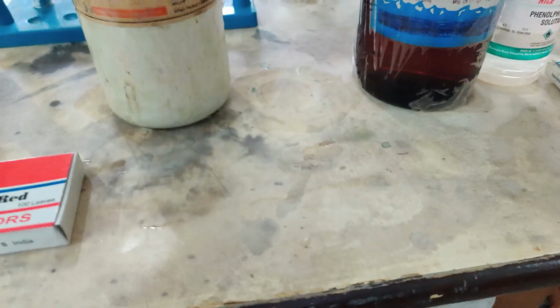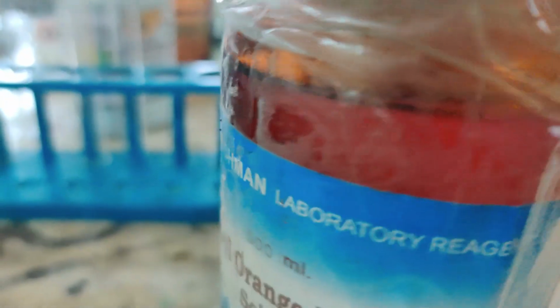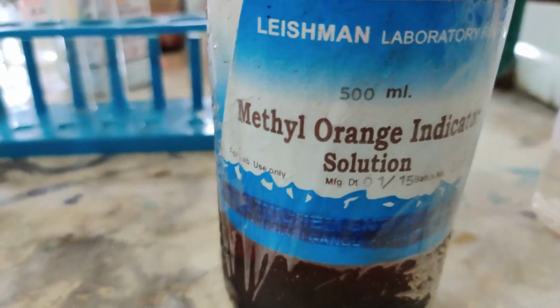Then the third one is your methyl orange. Here it is. This is a methyl orange bottle. You can see inside the bottle it is an orange color liquid. The color may not be visible because the bottle itself is colored, so you will not be able to see the color of the indicator properly. But later on when I take it out in the test, you will see how it looks and why it is called methyl orange.